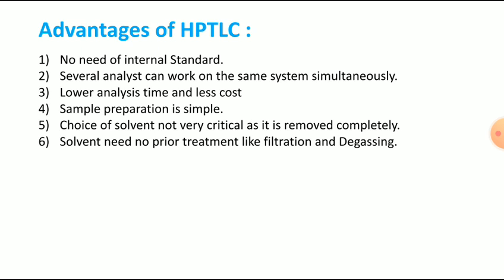For mixing or stirring of the solvent, or we can say removing any kind of dissolved gases. But in this HPTLC we are not using any kind of filtration or degasser system to remove contamination of the solvent. That means there is no prior treatment of the solvent system, or you can say mobile phase.